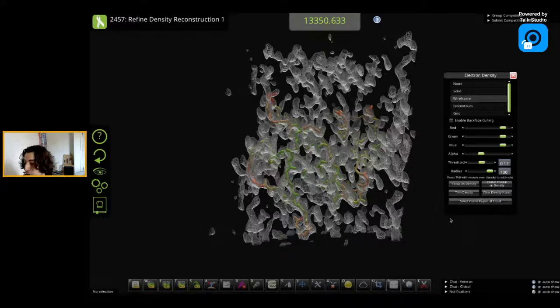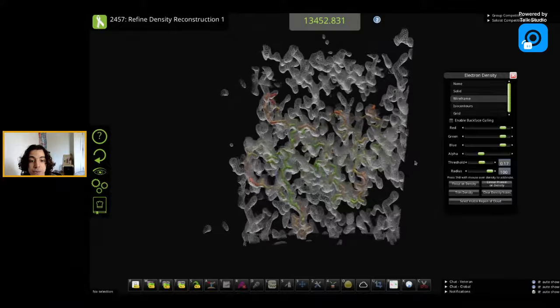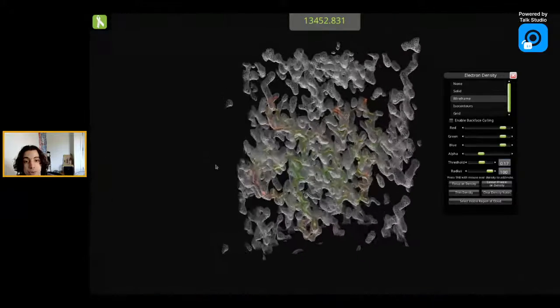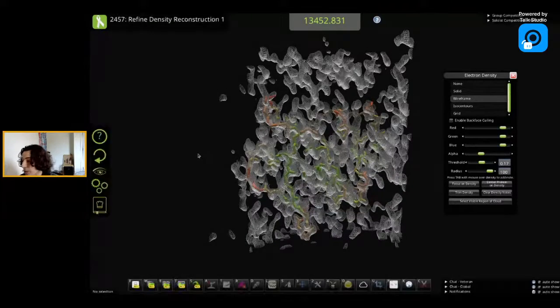And welcome to anyone just joining us. As I said a little while ago, this is a new thing we're trying. We're going to do demos on our YouTube live to show people, in this case, the new Rephase tool, the Refine Density tool that we added, and give everyone a chance to ask questions that we can answer live about the science of the tool, about how we think it could be used most optimally. So if anyone has questions, feel free to send them our way.